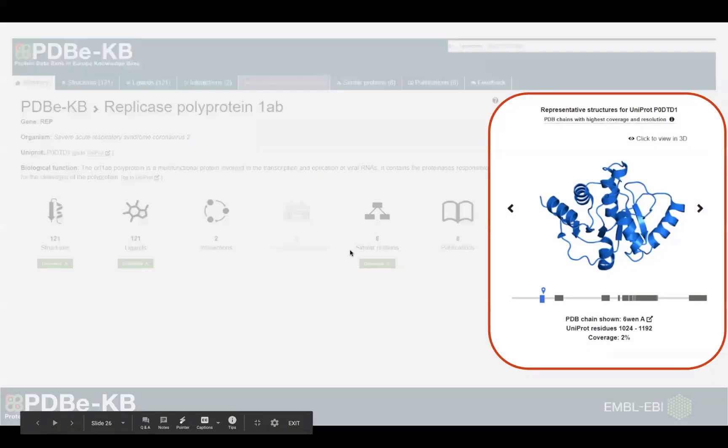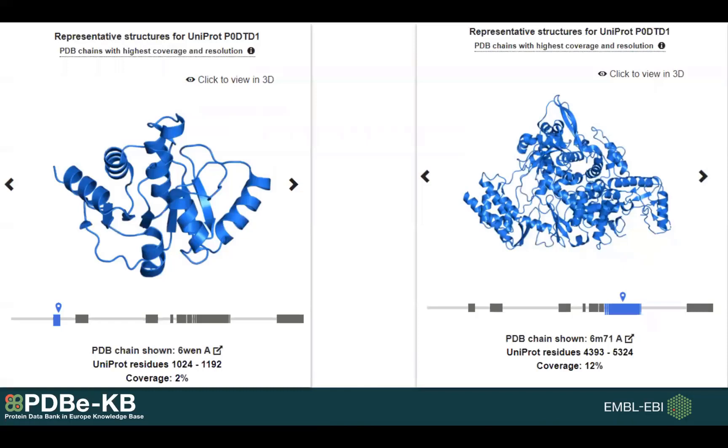One thing I would like to highlight here is this panel on the right. What you can see here is that the polyprotein is quite long and different segments of it are covered by different PDBs. For example, this blue box means that for that particular segment of the protein we have a PDB entry which happens to be 6WEN.